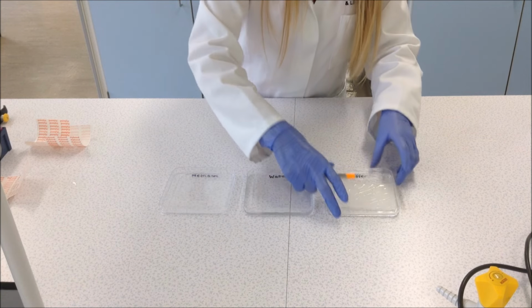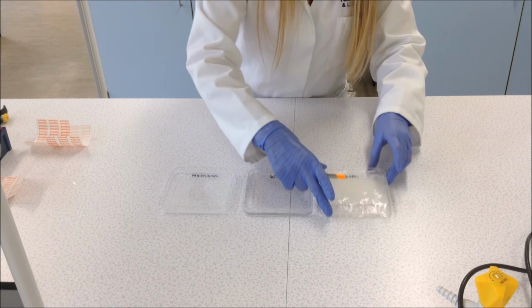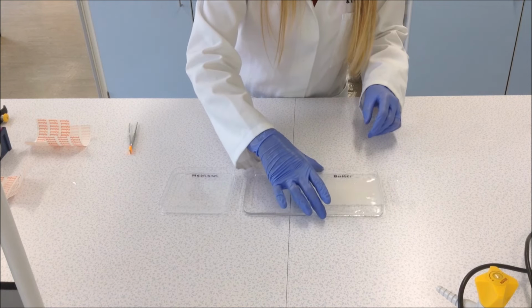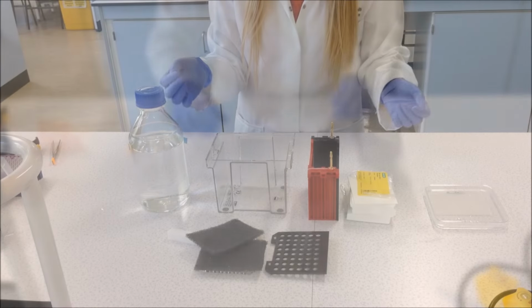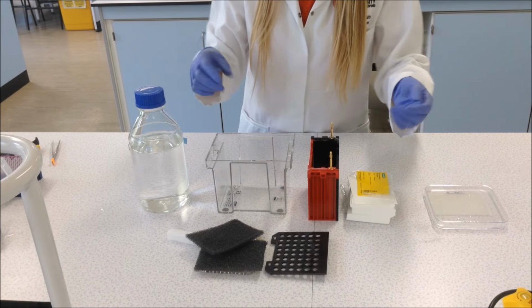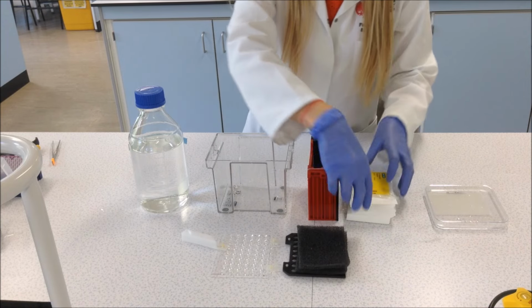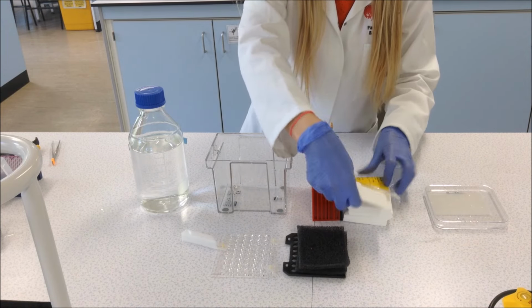After rinsing off the membrane, you can then transfer it into a transfer buffer, and it will sit in here until you are ready to continue the Western blot. For this next step, you will need two sponges, a blotting cassette, and some blotting paper.